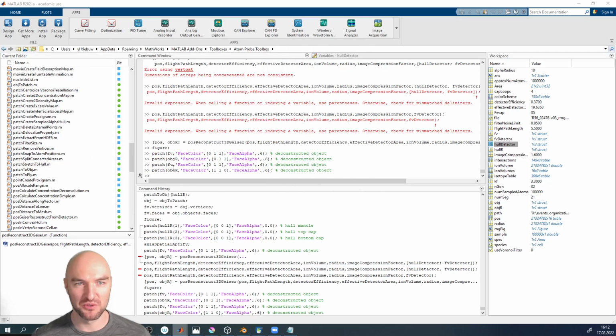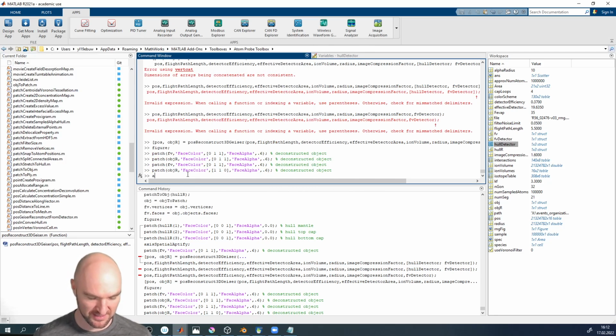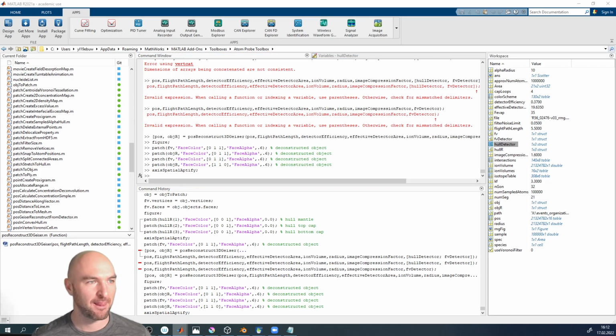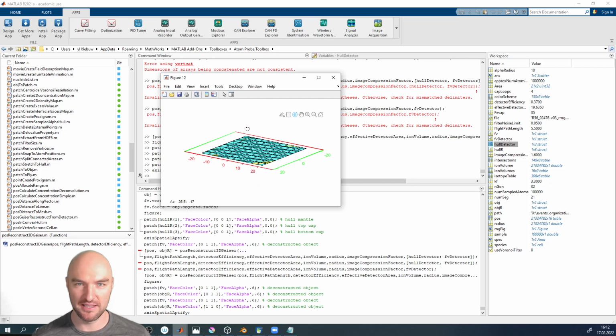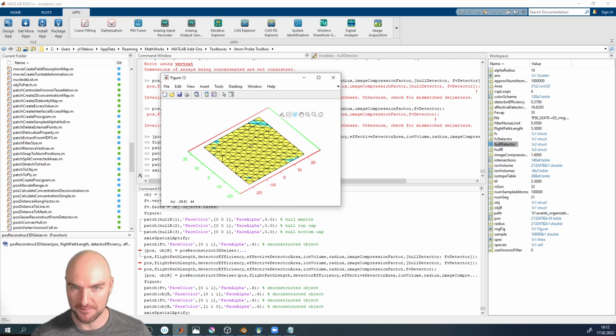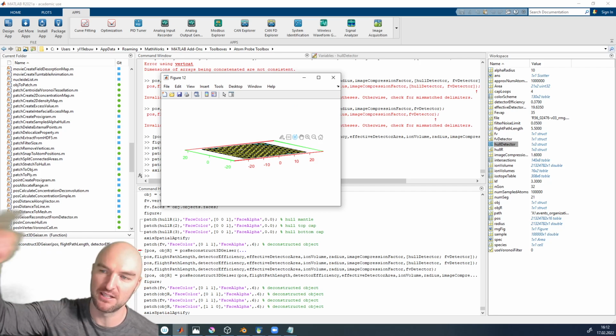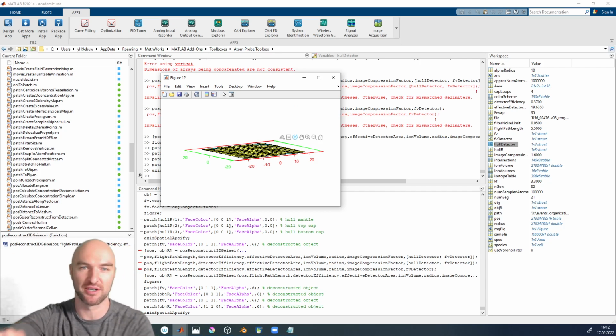And we are going to APT-ify our axes. And you can see that they are perfectly on top of each other. So what that means is that we have successfully completed an entire cycle of reconstruction and deconstruction.